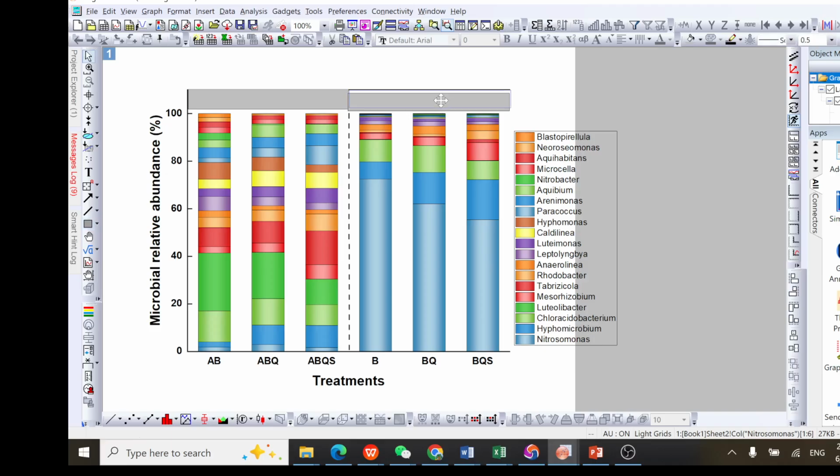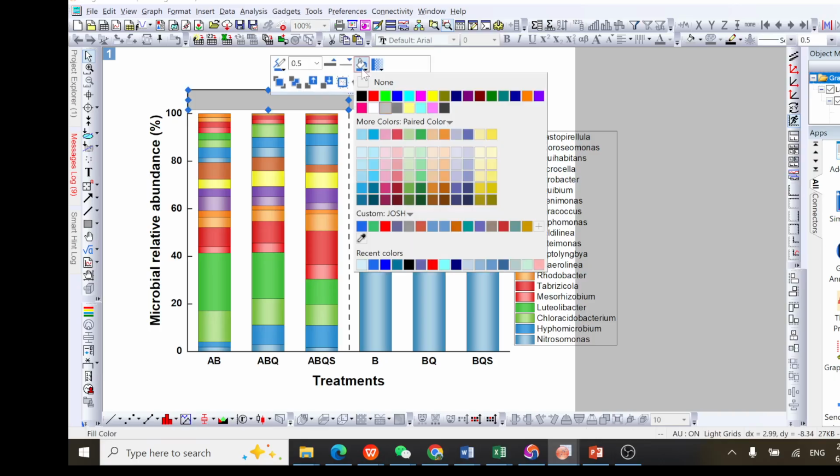Let it flop because I'm using it to teach. So I don't really have time to make it more beautiful. So you have this, like this. You can change the color. Just click on it and come to this place, color fill. You can choose any color you prefer. I don't like bright color. Let me go with this one.